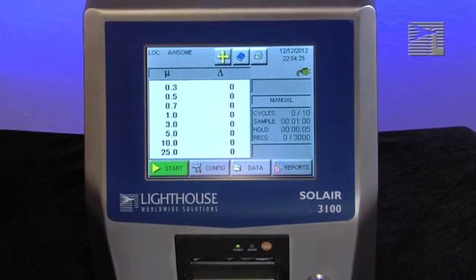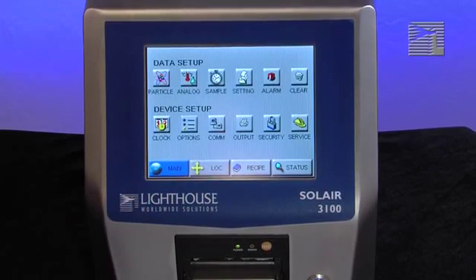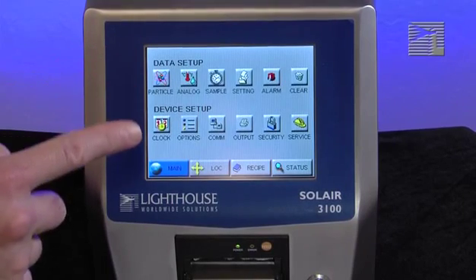From the main screen, press the configuration button located on the bottom section of the screen. This will take you into the instrument configuration screen.